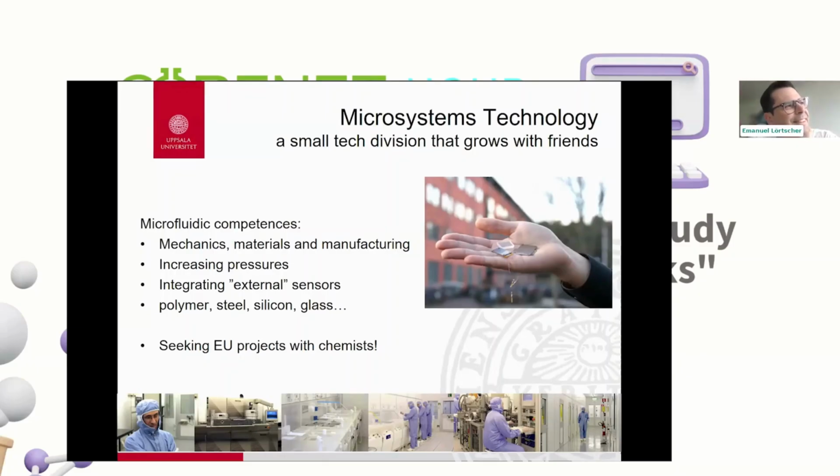I mean, not really. I mean, talking about compatibilities mainly material-wise and just from the platform, having now sensors operating at these high pressures requires a lot of changes compared to the traditional sensors that we have. I've given examples of how you can interface with the channels, with the electrodes and the optics. So I can also imagine having existing components that will be integrated on another chip. And if you do a rational, clever design, you can probably take the signals from the channels. So it's going to be like two silicon devices that you stack together. It's rather a system in package, a packaging approach.